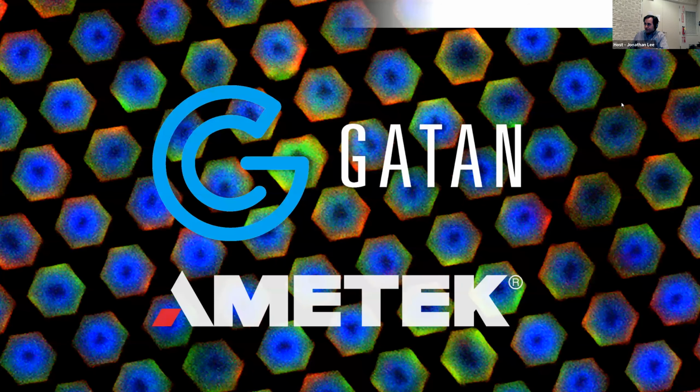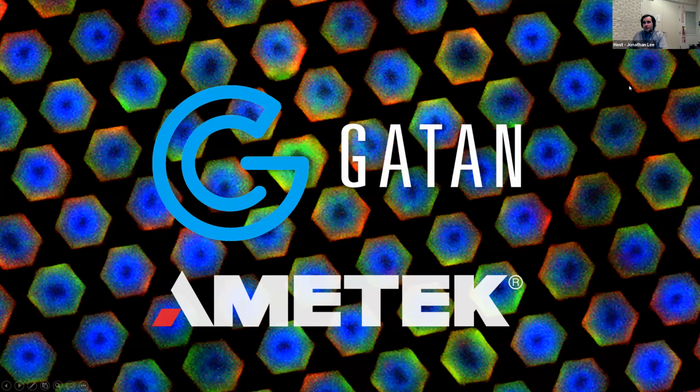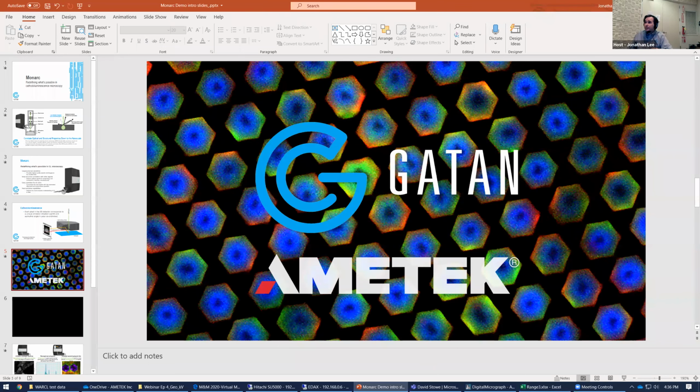Once you're able to control your CL system, you'll be able to generate really pretty pictures like this one, which is the only reason I show that image. This is a spectrum image that I've colorized of a bunch of indium gallium nitride core shell pillars. So it's an LED array. All right, so without further ado, I'll just jump in to start using the instrument.